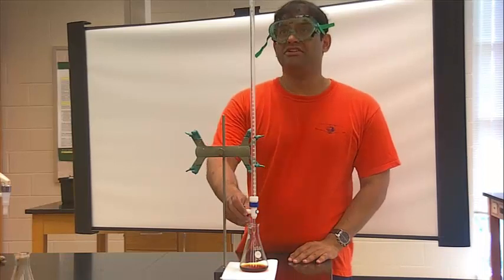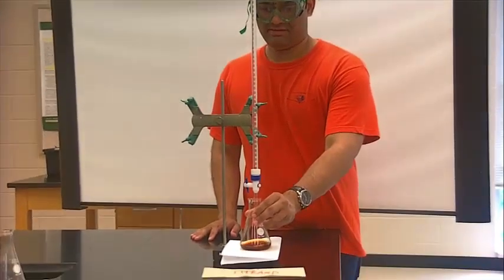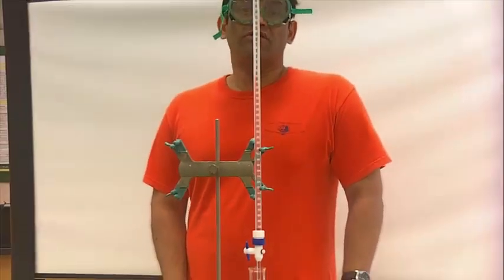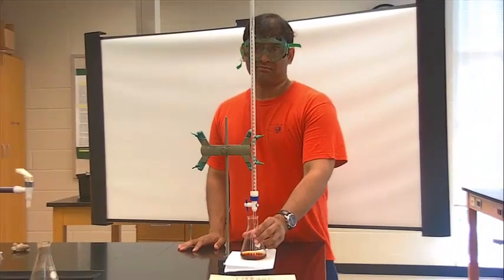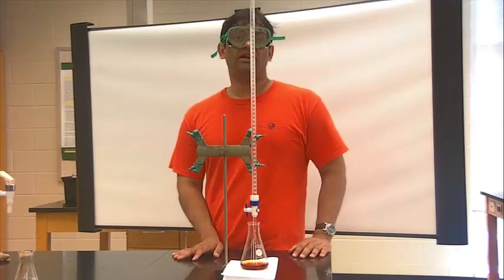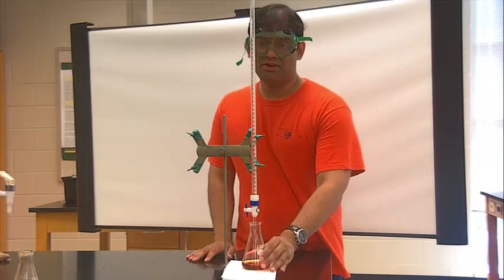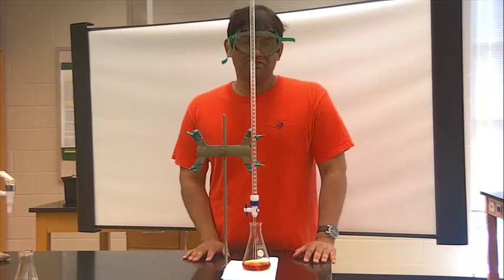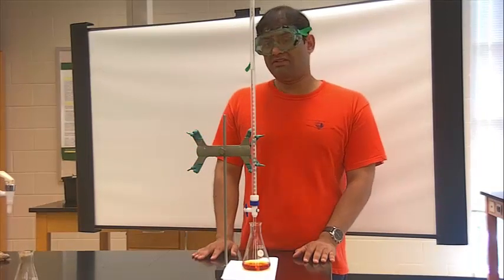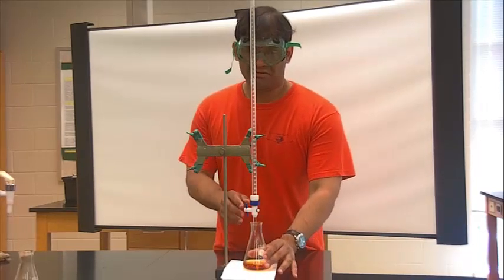So I can just dispense until I'm roughly 2 mils before the equivalence point. So that's why you want to do your trial titration with that 1 mil to 1 mil increment. You have that broad window to determine where the equivalence point resides. So from the 40 mil beaker of filtrate, you'll do the trial titration and an exact titration. This is what I'm doing now, the exact titration. And then the filtrate from the 80 mil beaker.